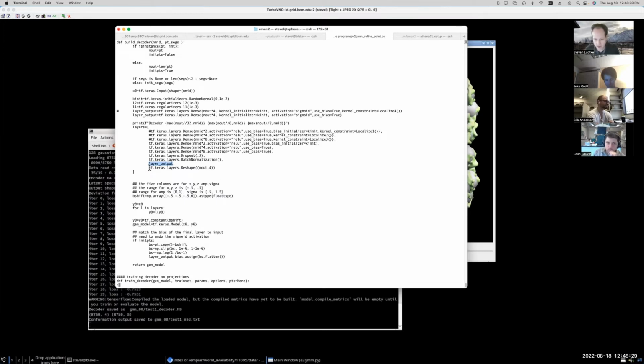And then the reason you have another layer after the output layer here is just so the output will come out as a single vector of size n, and you might want to reshape that. So in this case, we're reshaping that to be the number of Gaussians in our model times 4. So instead of times 5, it's times 4. In the original program, you'd find a 5 here. So the output layer was basically just a single vector, which was n out times 4 values, and now we reshape it so we get it out in a more convenient form.